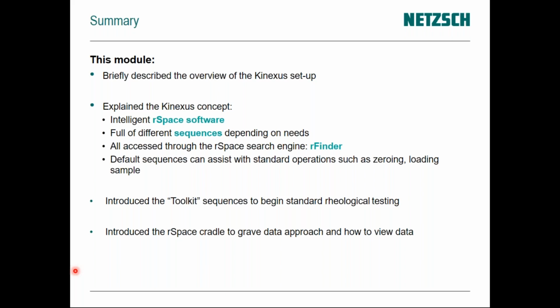So this basically lets you do a dry run on a sequence to see if it's working correctly, and it's giving you the kind of results that you want. So that's a good option to have too.